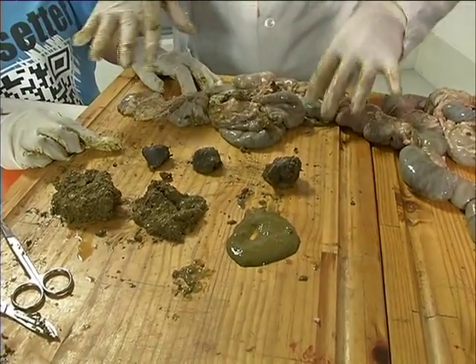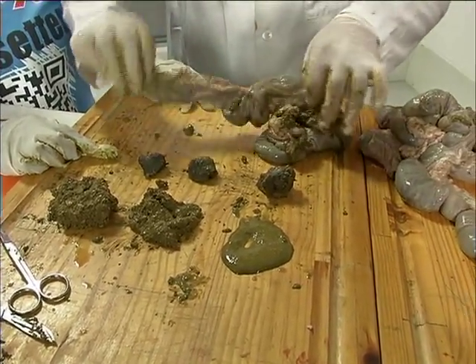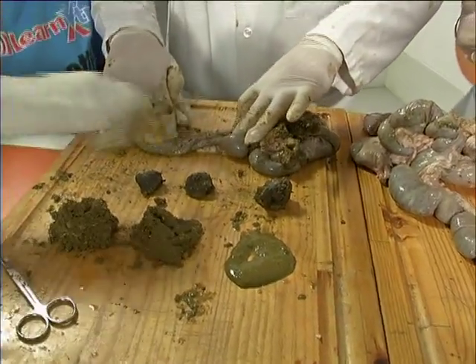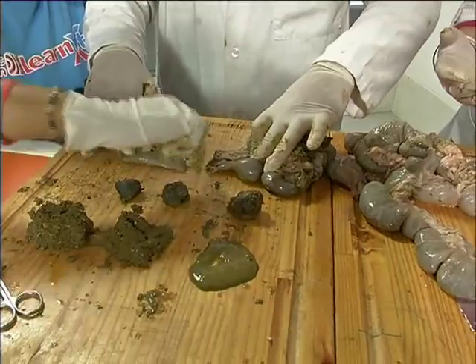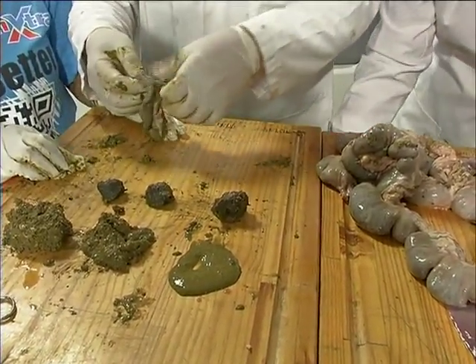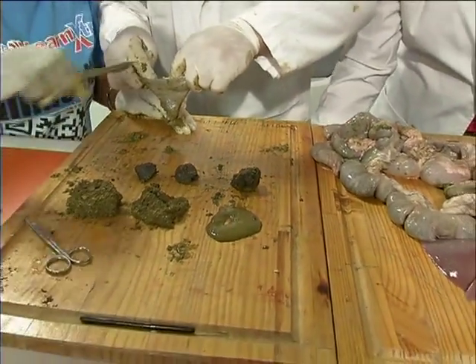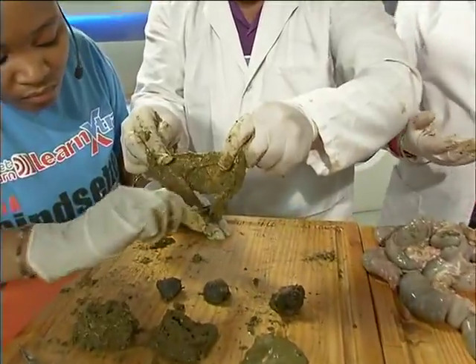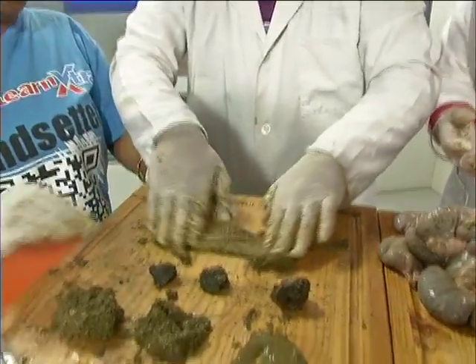Yeah. Okay. So this is the large intestine. But before we go, I know we showed inside everyone, so we need to do it. Lenny, slice it off there, Miss Winnie. Don't be shy. That's it. And there we go. Put it in there. Slice. All the way, Lenny. Don't be shy. There we go. Let's open it up.